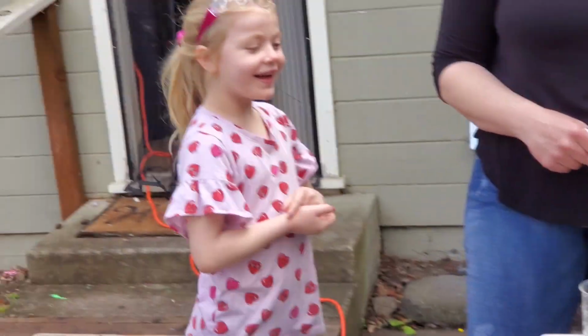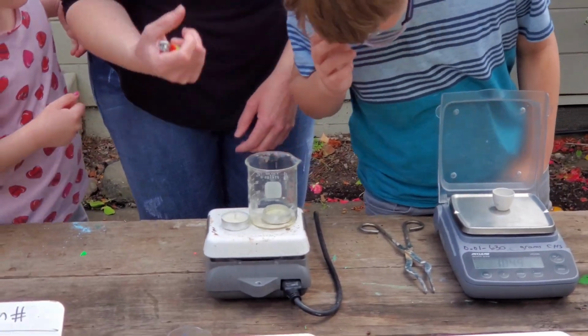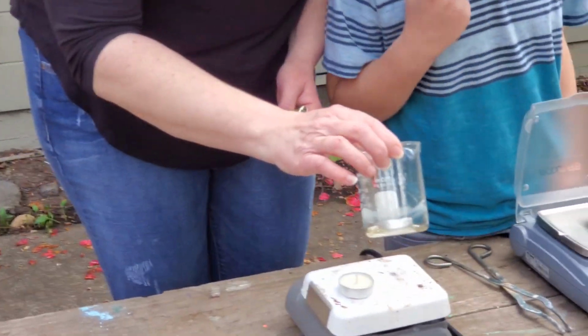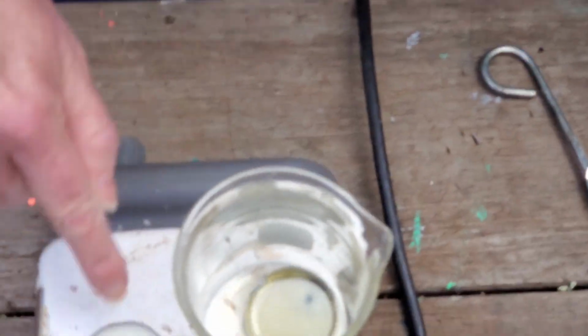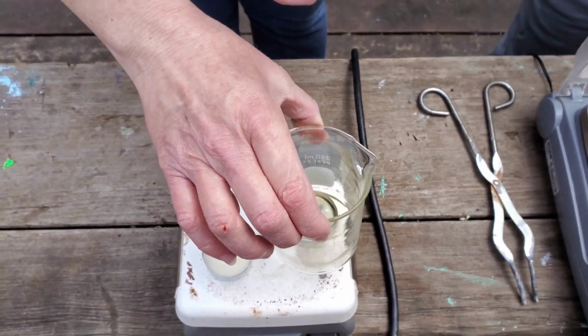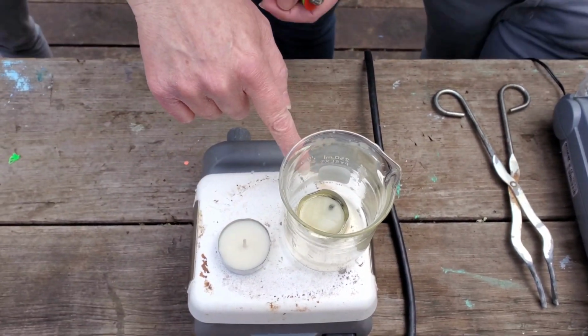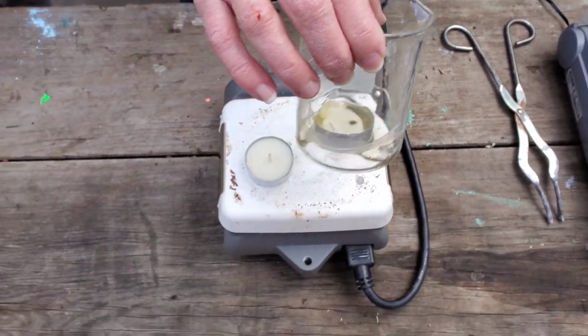Let's see. It's not brown. Troy, can you look and see? Come here with the camera. What does the wax turn into? It also turns into a liquid. It smells like birthday cake. So after heating, that wax, which is solid, becomes a liquid, and the liquid becomes clear.